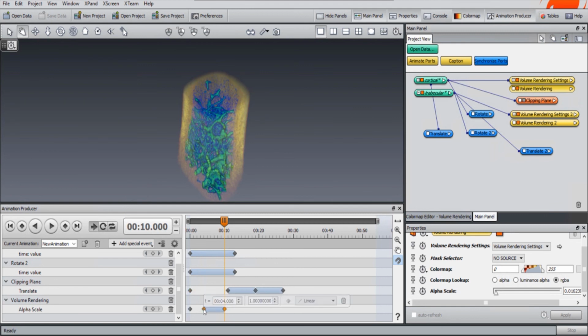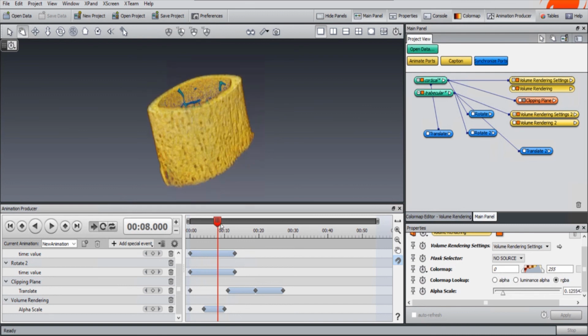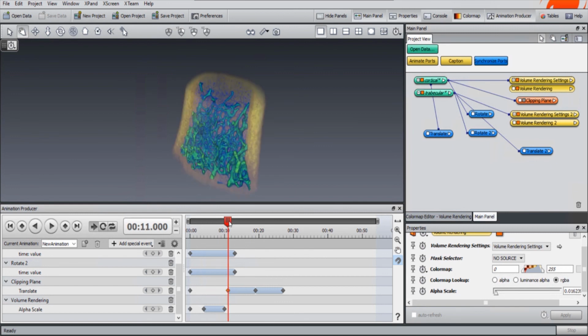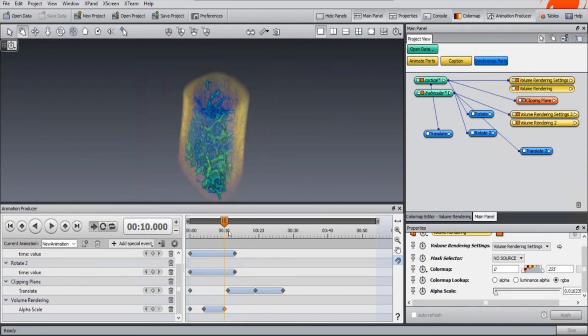Another thing you can do is when you click on the seed, you have this option here that is not going to show here, but you can move the mouse wheel to see how it is going to interpolate. And it's nice to have something. I want to have it a little bit faster in the beginning, so I can use this one. So let's see what happens. While it's rotating, it's changing color until it disappears. And if I just leave it, it's going to keep like this, and then it's going to crop from there. So I don't want this, let's move it here.